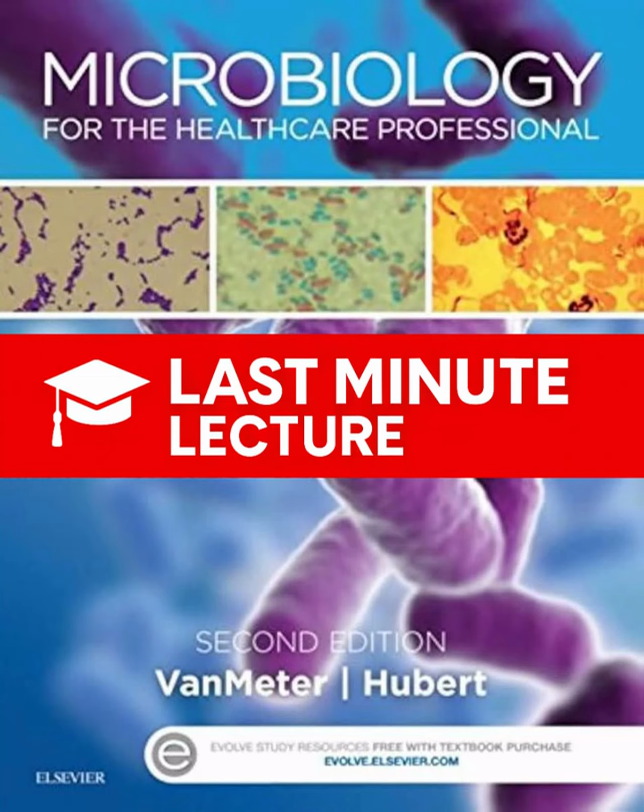We look at cultural characteristics, how it grew on the agar plates or slants. And maybe most importantly, we test its physiological or biochemical characteristics. What enzymes does it have? What sugars can it ferment? What waste products does it make? Cultural characteristics, what does that mean? Like how it looks growing? Yeah, things like the texture, the color, the shape of the colony. On slants, we use terms like filiform for thread-like growth, echinulate for spiny edges, arborescent like a tree.